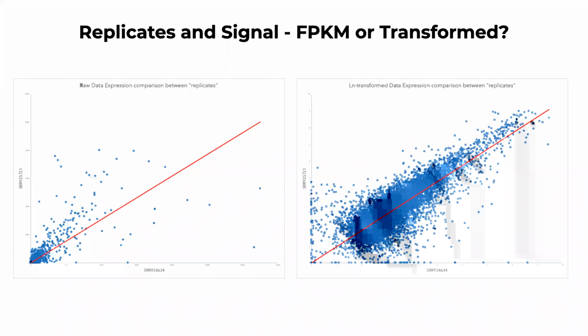they could still be very different because we captured the data at different differentiation state, or we captured the data in different biological condition or even time. We still expect the bulk of our data to be sort of comparable between the two samples. And so what you can see here are how those are comparable when we look at correlation between the genes in those two samples. So to really practice this a little bit, let's try and do that in Excel.